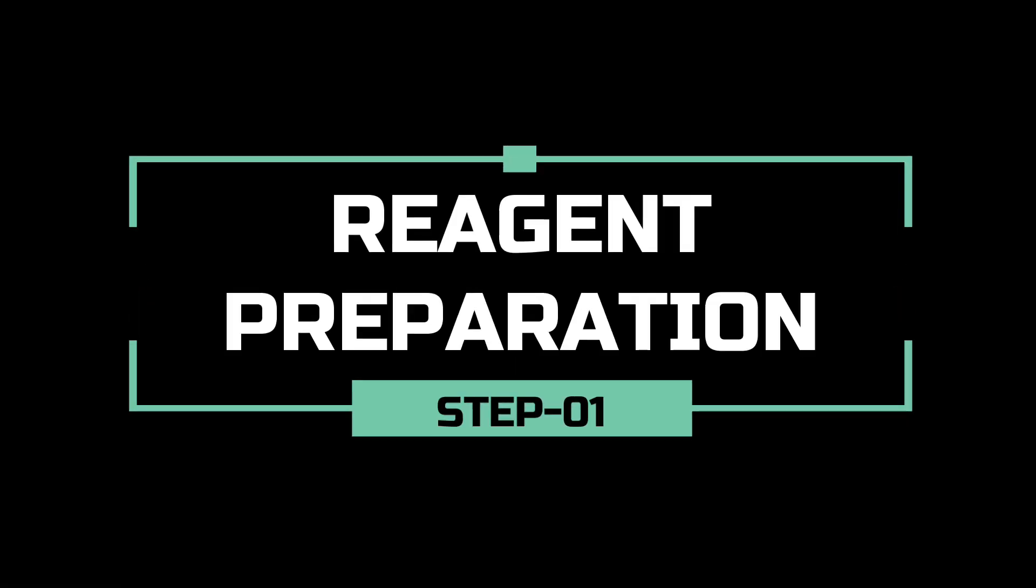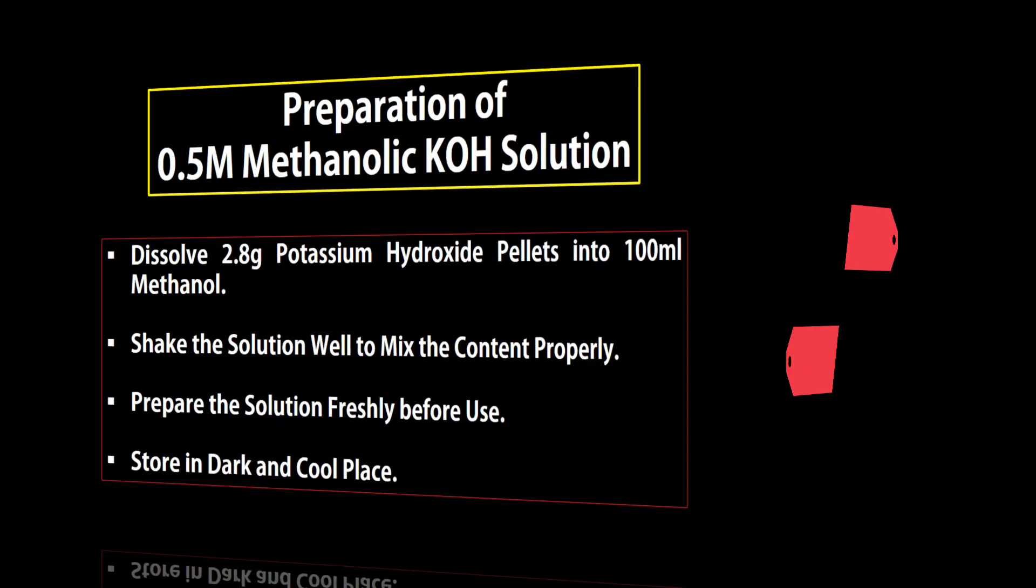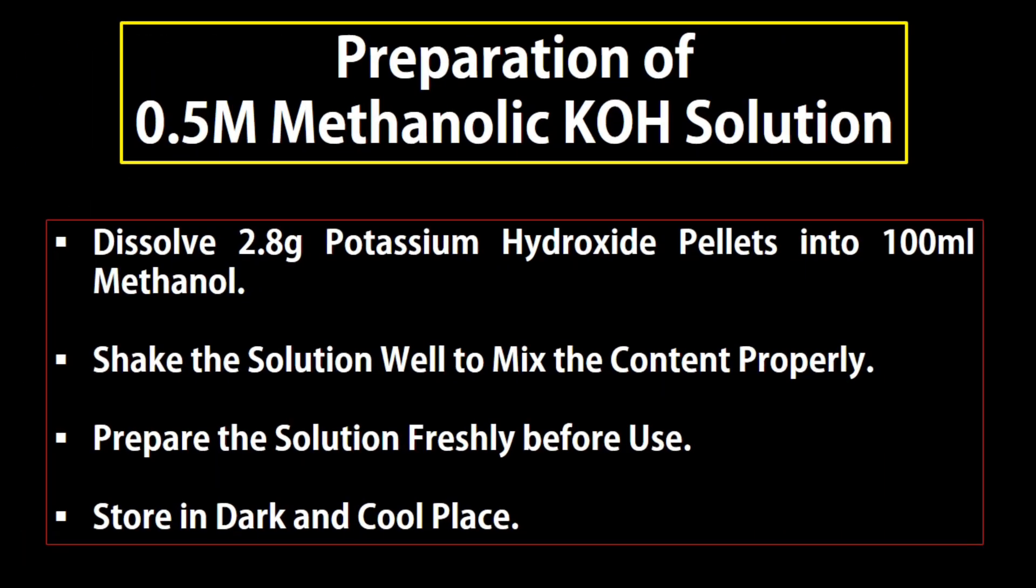First step is all about chemical and reagent preparation. For the preparation of 0.5 molar methanolic potassium hydroxide solution, dissolve 2.8 grams potassium hydroxide pellets into 100 ml methanol.